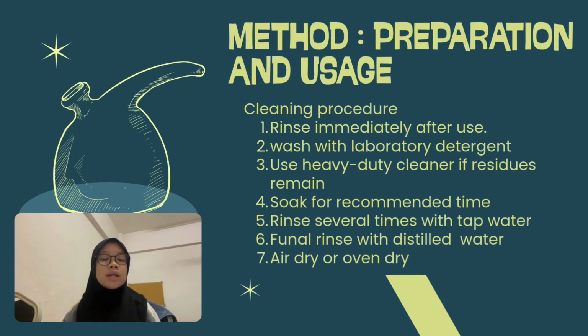So now, let's take a look at a proper procedure for cleaning analytical glassware. First of all, the glassware is immediately rinsed to prevent the chemicals from sticking or drying to the surface. It is then washed with detergent to remove the grease and general contaminants. If the stubborn residue still remains, a suitable heavy-duty cleaner should be selected. Acidic solutions such as dilute nitric acid are commonly used to remove metal ions, while sodium hydroxide solution can help remove fats and protein residue. And organic solvents like acetone or ethanol can be used to dissolve non-polar organic compounds.